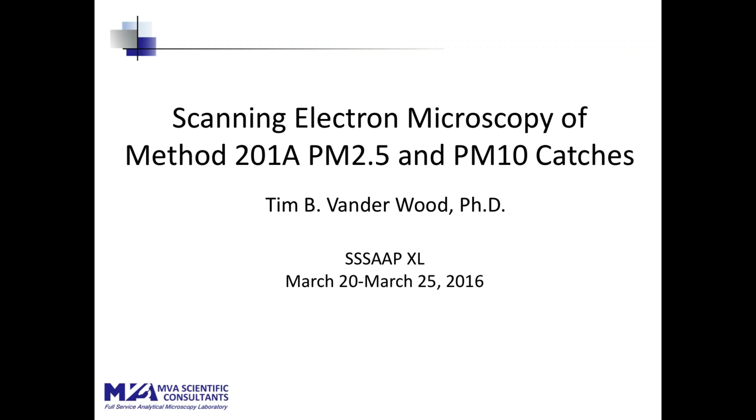Recently as last week, in fact, I gave this talk to the SES meeting in Alabama, and we talked about what we found on method 201A catches. It turned out to be of great interest to the community, and I thought we would repeat it here.